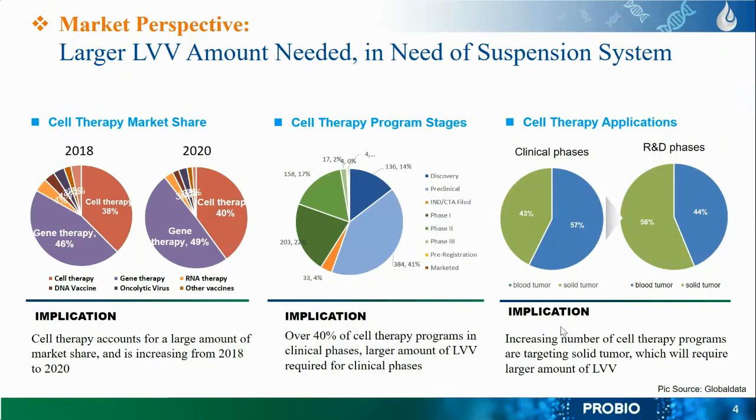And this characterization of the LVV has gained significant improvement in recent years. A large number of functional lentivirus particles are required for clinical trials.